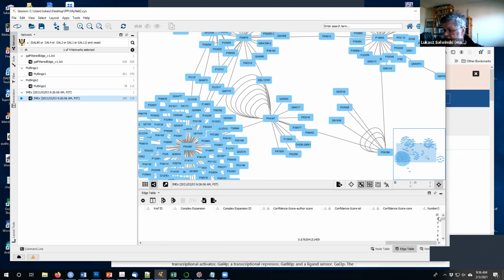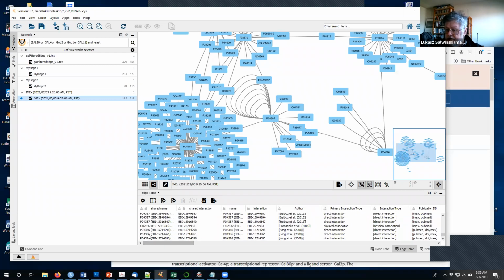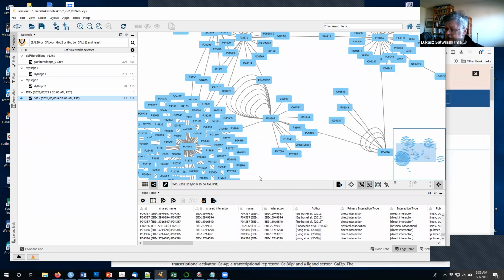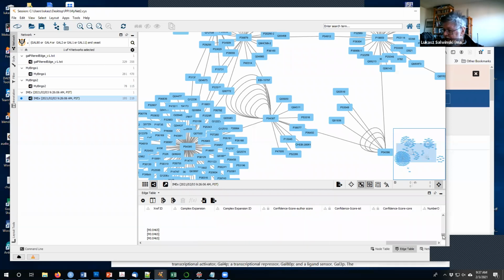So that, I think, might be the actual result of whatever the operation did. Now, oh no, this is actually not true. Let's see. Oh yeah, this is actually not true. So if we check here, those are the number of interactions that were contributing to a given edge. Okay, we are left with several entries without any number created.